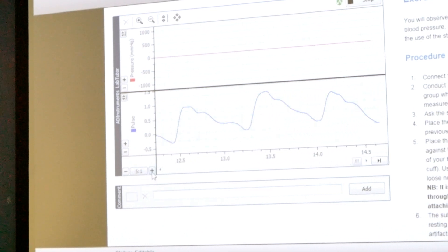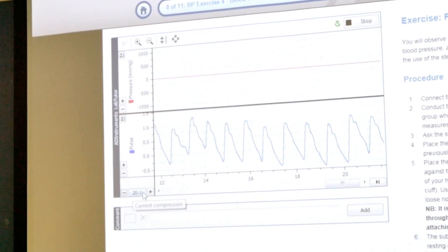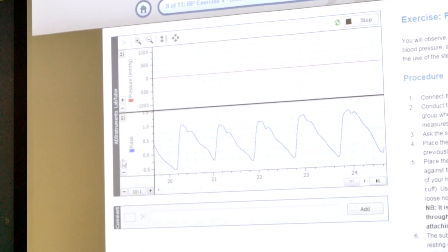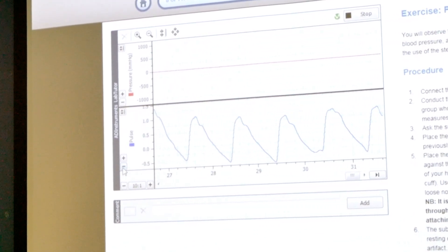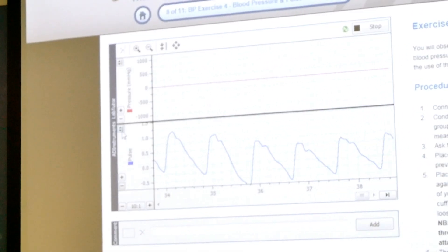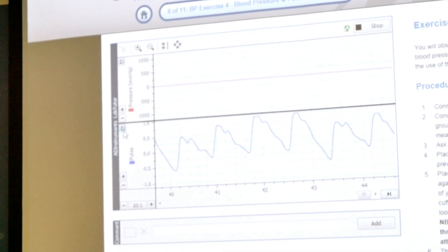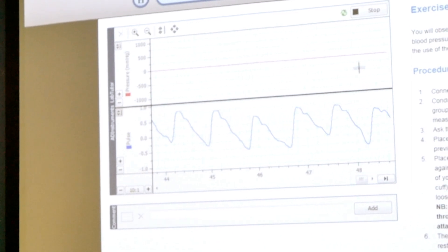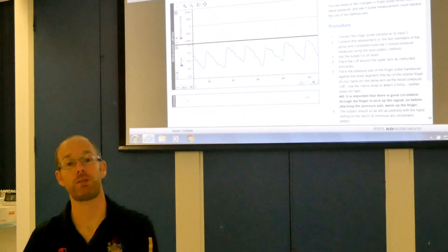When we want, we can speed it up or slow it down at the bottom, or zoom in or zoom out. Whenever you're collecting data and want to review it, the auto scale button down here is most useful because it will automatically scale to the right scale you need. We've now collected enough data so we can press stop and move on to analyzing it. How you can do that will be shown in the Lab Tutor software video.